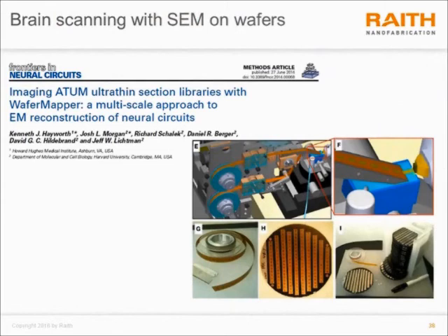Quite a lot of effort has gone into properly preparing these samples to fixate these cells with osmium tetroxide and further with uranyl acetate and preserve the ultrastructure and the myelin sheaths. It is quite an art in itself. So there are a variety of ways of preparing these samples. And so it's important to have flexible instrument detection capabilities.